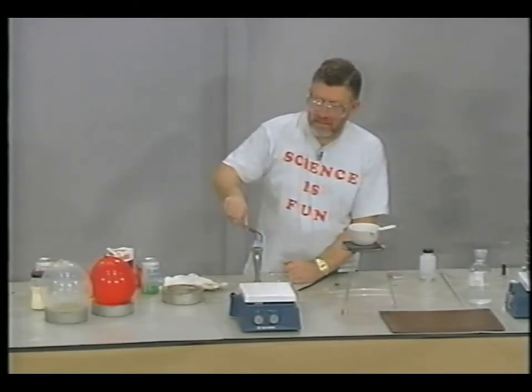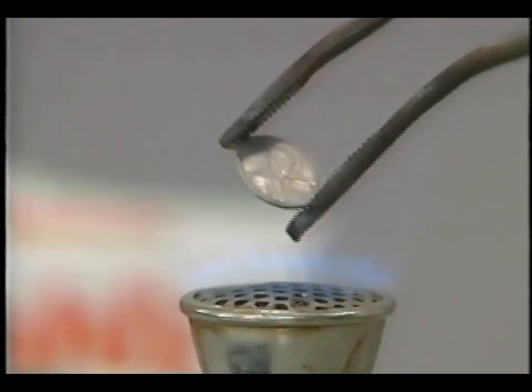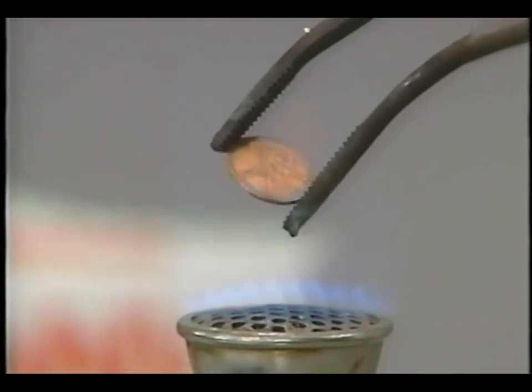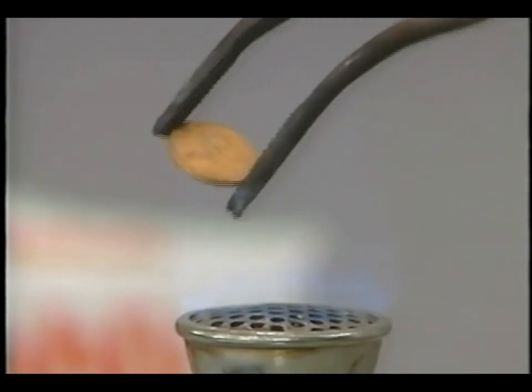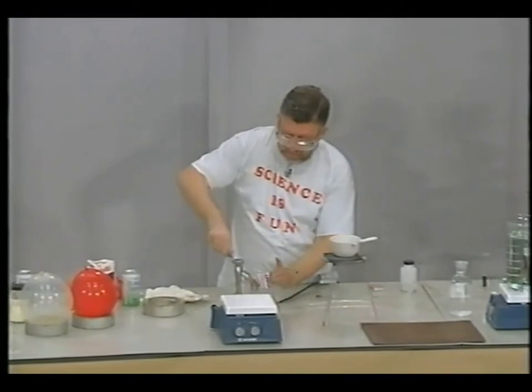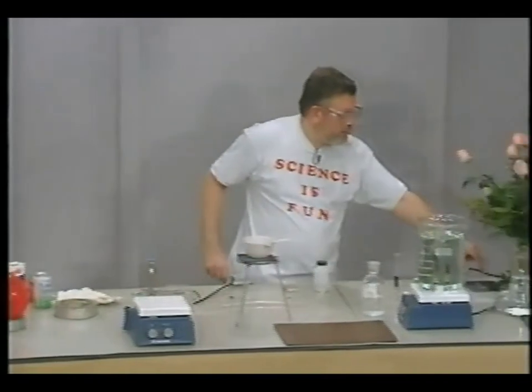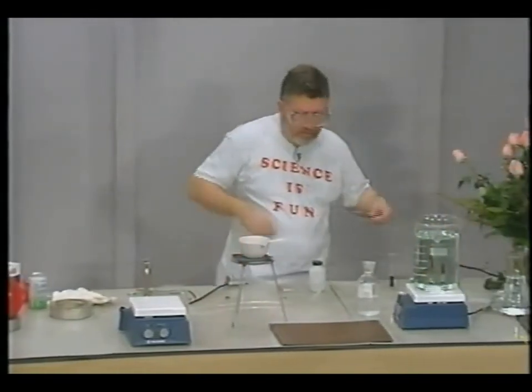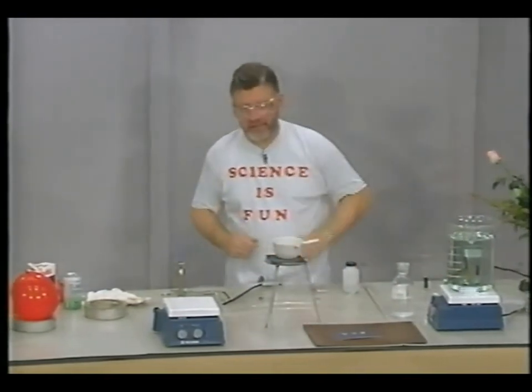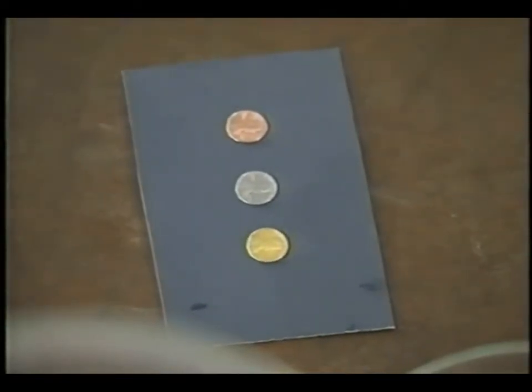So watch and see what happens to the penny. And you see it's beginning to change color. And there, you see? And we have achieved the alchemist's dream now by making copper change to silver change to gold. Let me cool this off. And I'll show you what I did before you came to my lab. I'll show you what looks like the transmutation of copper to silver to gold by looking at these three pennies that you have there.